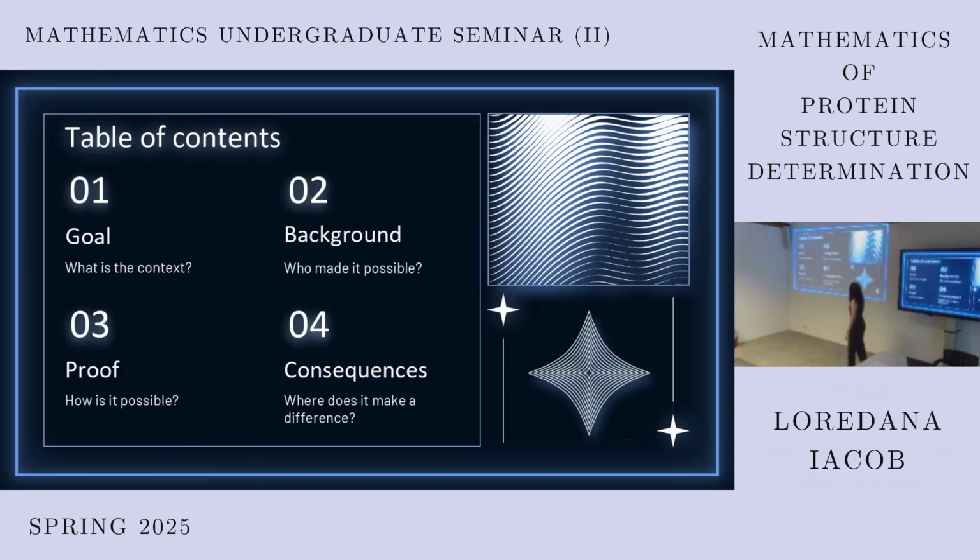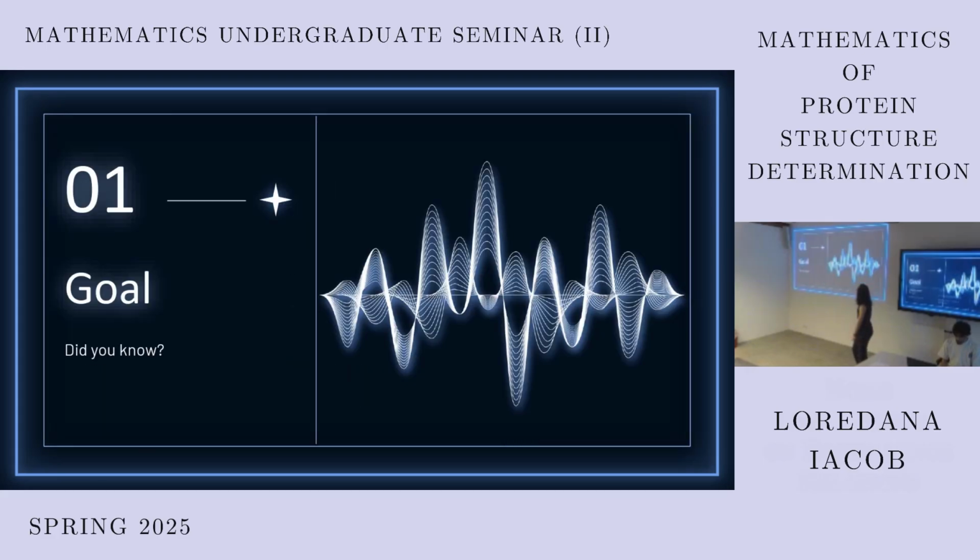First of all, I'm going to introduce you to the context of how we determine the structure. Then I'll provide some background on the physics behind it. I'm going to prove the most important law in this scenario. And finally, we're going to determine the structure of a protein.